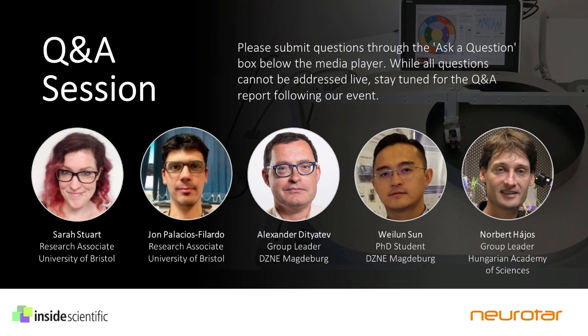Okay, perfect. That's a great answer. So the next question I think is most relevant to Wei-Lun or Alexander. Can you specify how image analysis was performed to quantify morphology of microglia and velocity of microglia approach to a photo damage site?